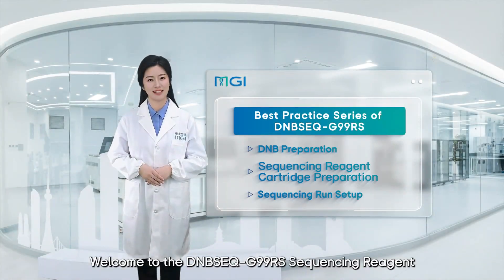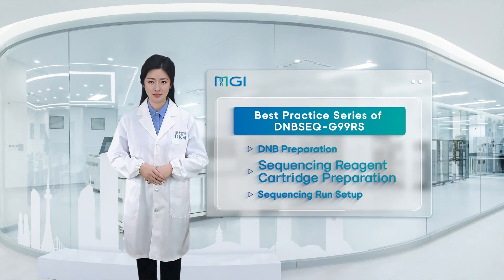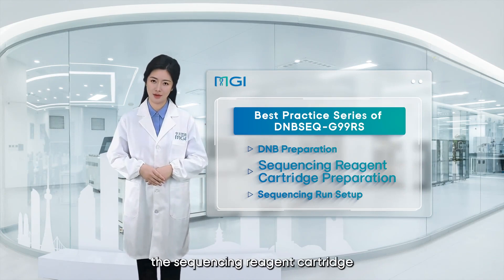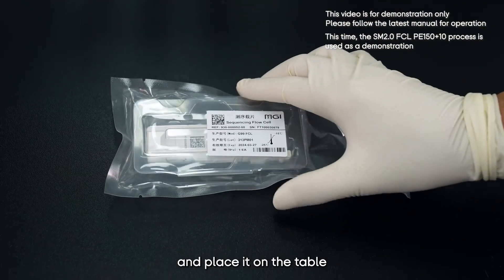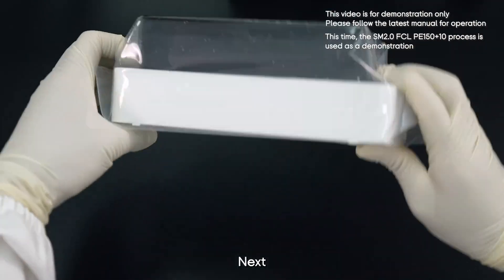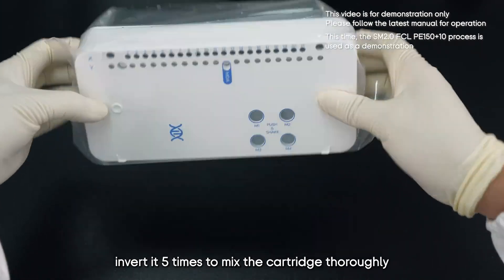Welcome to the DNBseq G99 sequencing reagent cartridge preparation section. After completing DNB preparation, we can now start preparing the sequencing reagent cartridge. First, take the sequencing flow cell out of the sequencing reagent kit and place it on the table, letting it incubate at room temperature for half an hour. Next, take the thawed sequencing reagent cartridge and invert it five times to mix thoroughly.